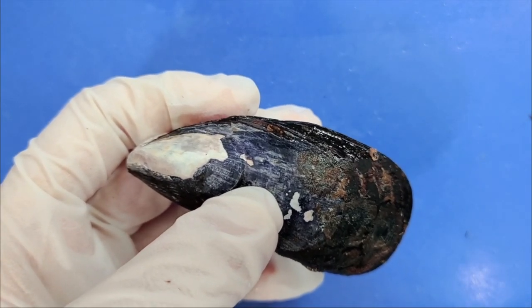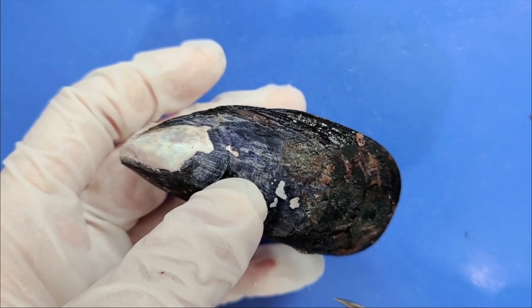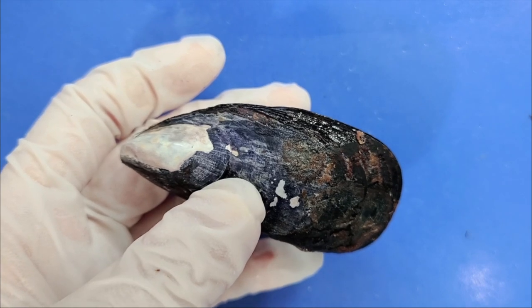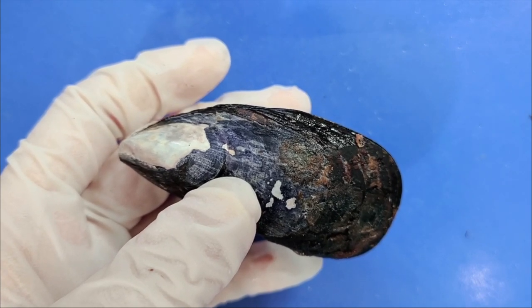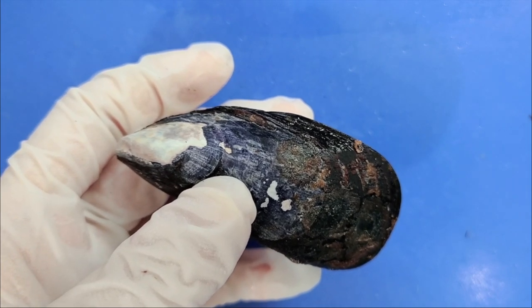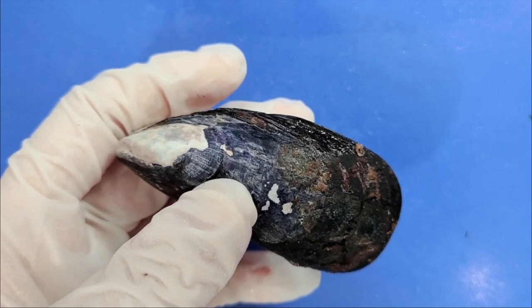However, the movement of mussels is limited. Most mussels actually stay in one place for their entire lives. Now, mussel shells carry out a variety of functions, including support for soft tissues, protection from predators, and protection against drying out.